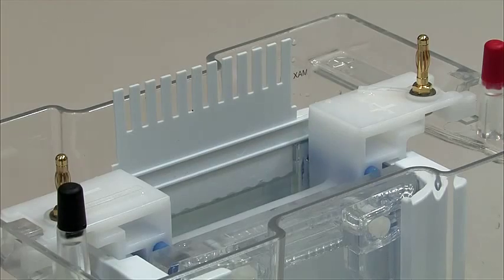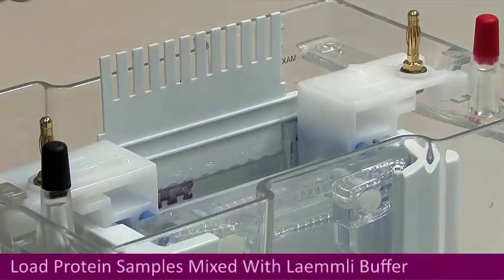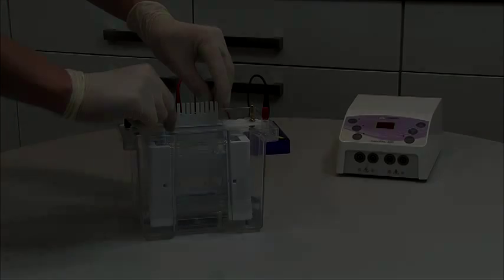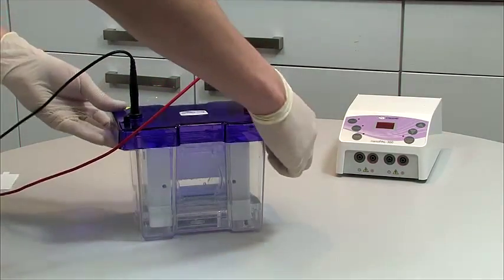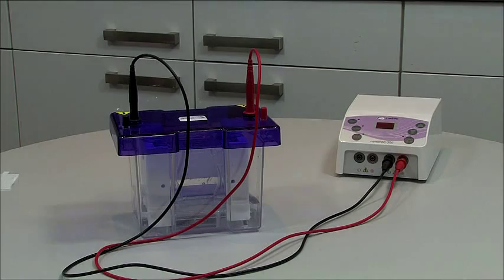Turn the combs upside down and reposition above the wells. Use the inverted combs as a template to position the pipette above each well during loading. After loading, replace the lid and insert the power cables into the corresponding colour coded ports in the power supply.